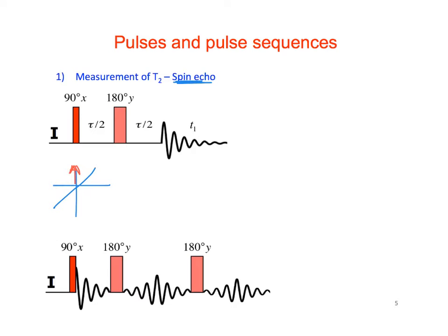We do a 90-degree pulse. Flips everything into the XY plane.